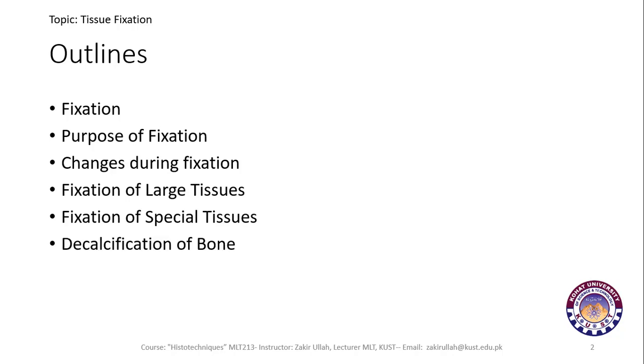And in the last we will discuss the decalcification of bone, how bone is decalcified, how the minerals are removed to soften the bone. So, these are the outlines of today's lecture.